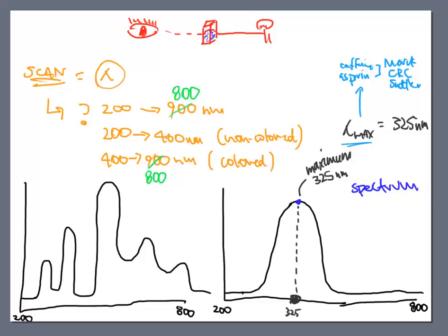No one said that you just have to pick one thing off the buffet and eat it. The same thing is happening to the molecules. No one told them that they just had to pick one wavelength of the entire electromagnetic spectrum and be happy with it. Some molecules are happy with an assortment of different wavelengths. And sometimes on a scan, that's something that I could see. But the terminology is still the same. So I can go through and I can look at each top of the hump. The one here, there's one there. There's one there. One here. And one there. All of these are favorites of the molecule.